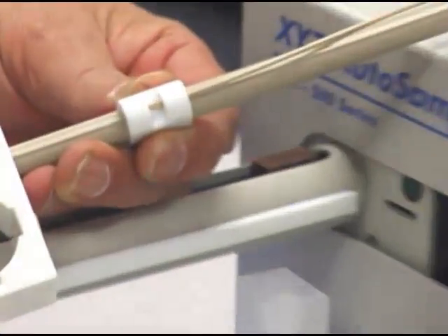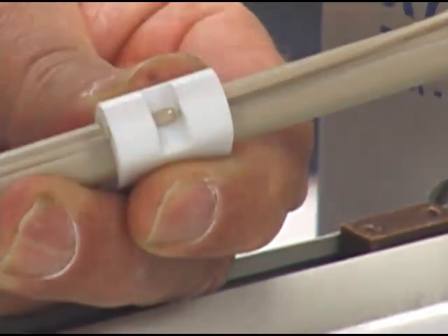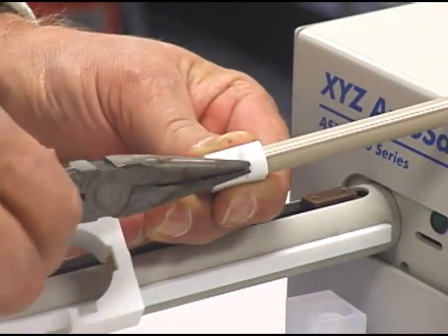Now we need to cut the peak tubing out of its clamp, so we need a pair of side cutters. We'll cut that at the top, pull it out from the top, and then we'll need to get a pair of needle nose pliers and get in there and pull that other piece out.